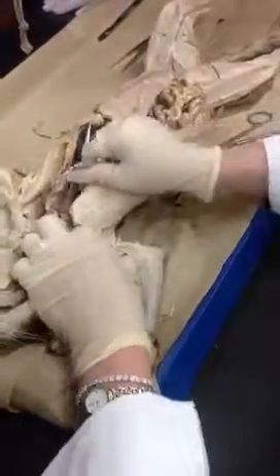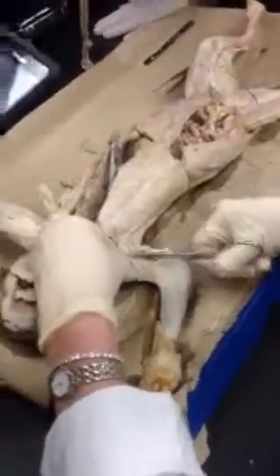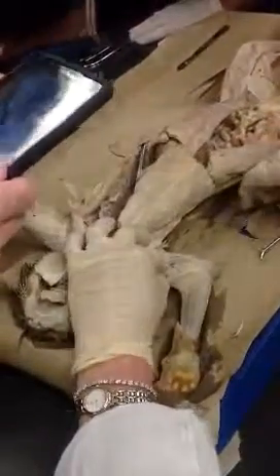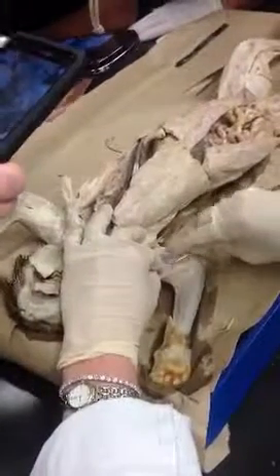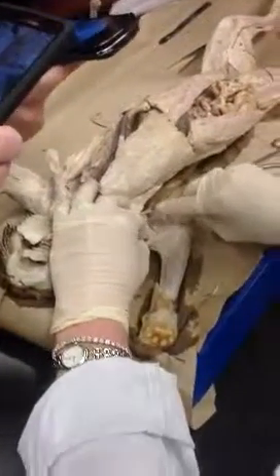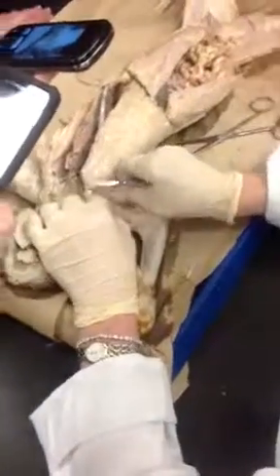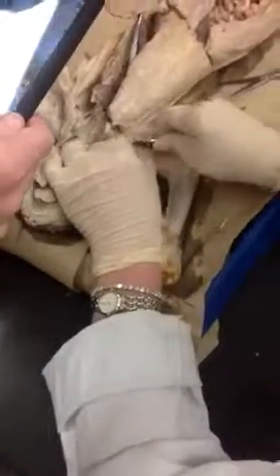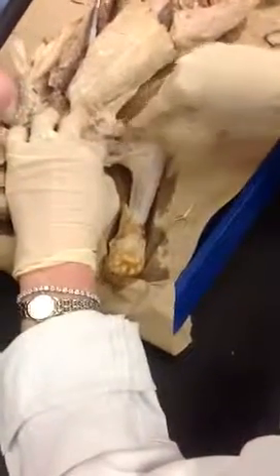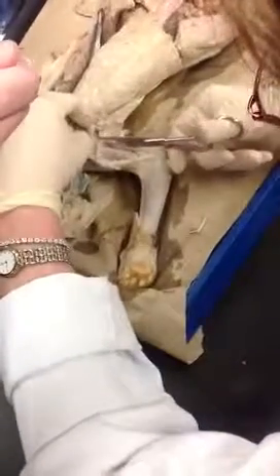What you can also do through this is maybe come to the arm and work your way back. Sometimes that's even easier. As you can see, the major vein there, the artery should be right next to it. The artery, the lymphatics, the nerves. There's the artery. It's still axillary at that point? No. Is it brachial now? Yeah, but let me show you where it branches before we get too far ahead of ourselves. Okay, but see how I'm kind of backtracking now? Sometimes you can do it from this side and then kind of work your way back.